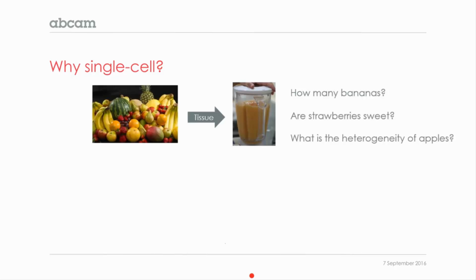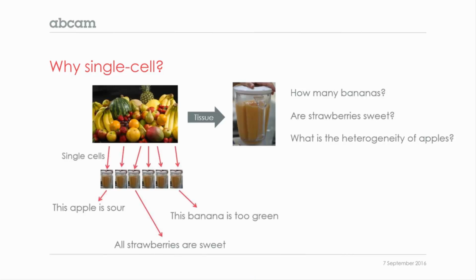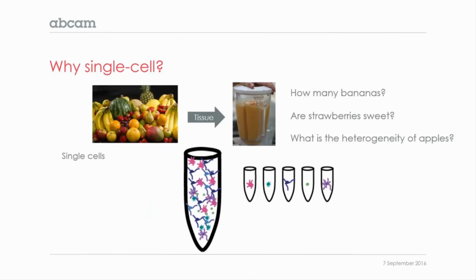Instead, another idea is to take each one of these fruits and put it in an individual blender, and then analyze the composition of this fruit, and then we can answer particular questions about each one of these elements. And what we want to do is basically the same with cells. We want to take a very complicated tissue like the brain, dissociate it into a single-cell suspension, and then put each cell in a different compartment and analyze its composition. So this is basically the motivation and a little bit of background.